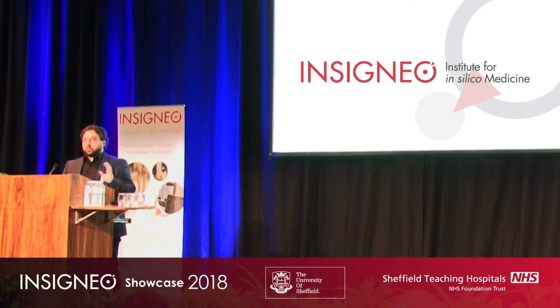I would like to talk today about strain measurements in bone. It's somehow related also to the first talk of Andrew, where the challenge there is to catch strains in soft tissues, so large strains. In our case, for musculoskeletal application, the big challenge is to catch small deformations. So I will try to give a flavor of what we can do with our digital volume correlation approach.